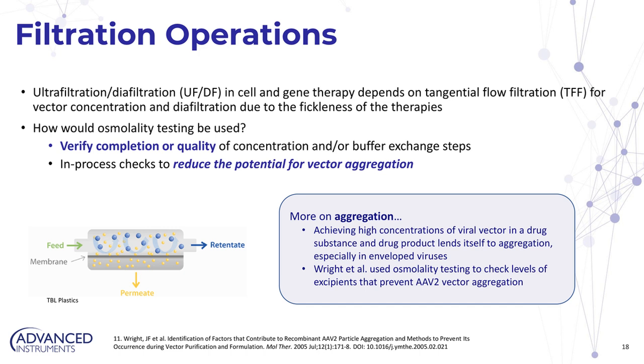And we know that this really lends itself to aggregation issues around filtration, especially within enveloped viruses. So I wanted to highlight, there's a study that I have cited here on this page where they actually used osmolality testing to check the levels of excipients, so check the different concentrations and osmolalities of different excipients that they knew would help to prevent aggregation within AAV2 vectors.